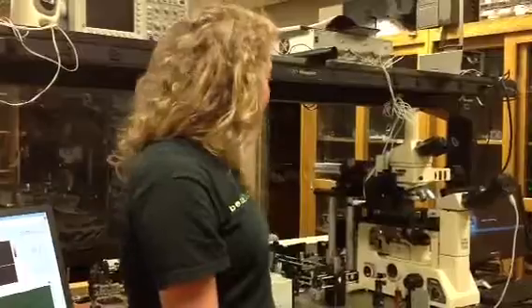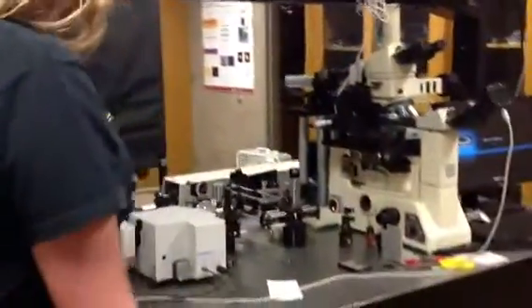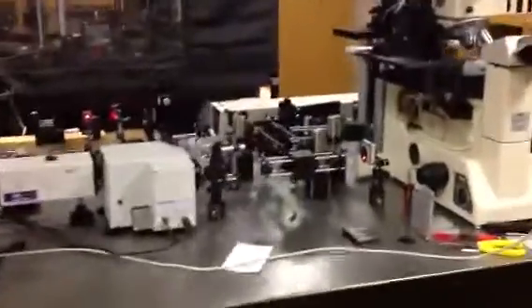Today I'm going to show you our setup in the lab and then as well go through the LabVIEW VI that we have. Here we have our HeNe laser. It diffracts off of the spatial light modulator and then it comes in through here, is guided into the microscope.